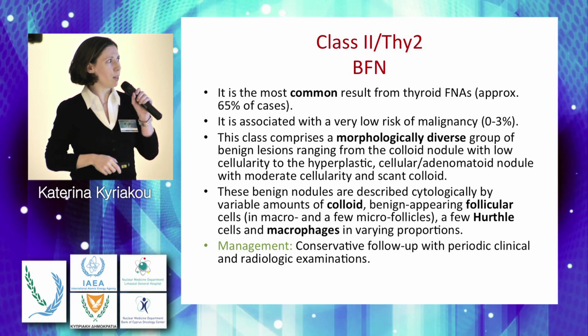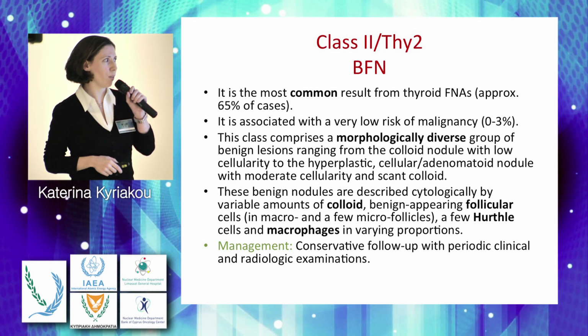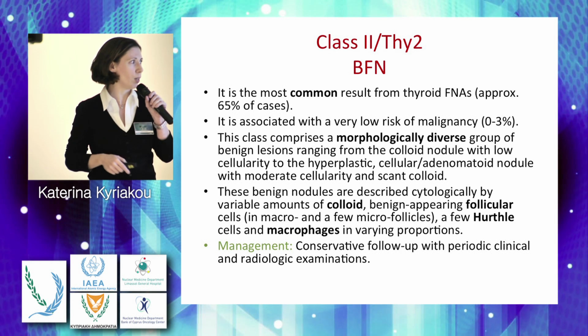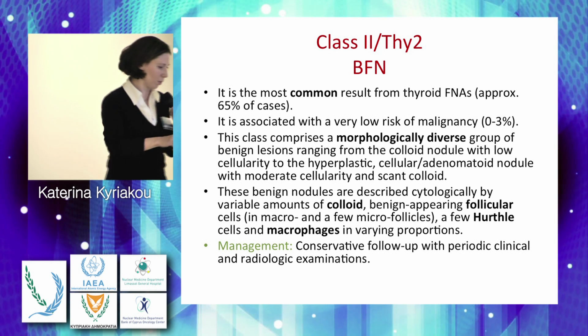And in these lesions, we have variable amounts of colloid, benign appearing follicular cells, a few Hurthle cells I will describe later, and macrophages when we have cystic degeneration. And the management is conservative follow-up with periodic clinical and radiologic examinations.